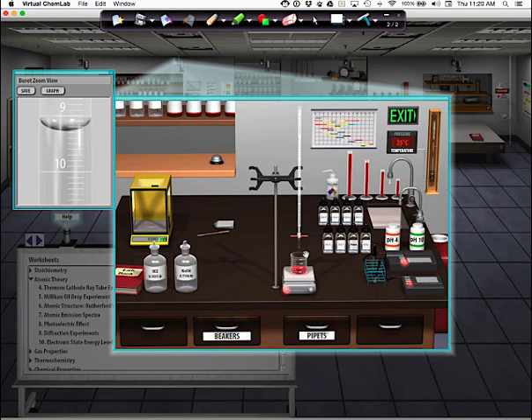So notice what it says in step 17. Record the volume. And guys, this is the volume. How would we record this volume? So this is 9, this is 9.1, this is 9.2, this is 9.3. What's that? 9.28?